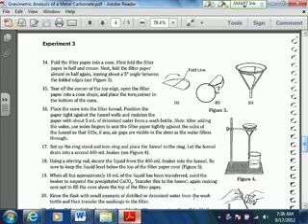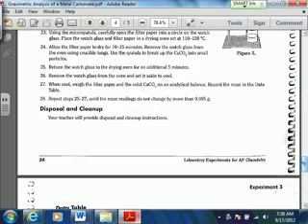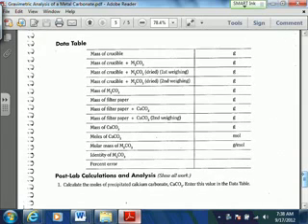So anyway, go ahead and do that with the corner of your filter paper. I know it's a little bit strange, but I don't know that there's anything else here that's out of the ordinary. Just make sure you're following the directions. We are going to put these in a drying oven overnight and then measure the mass the next day. We'll probably only get one trial of this in, but it looks like that's all they're having you do anyway.